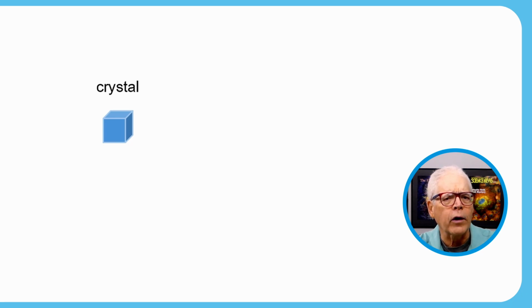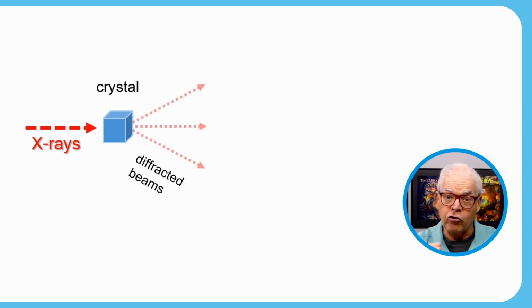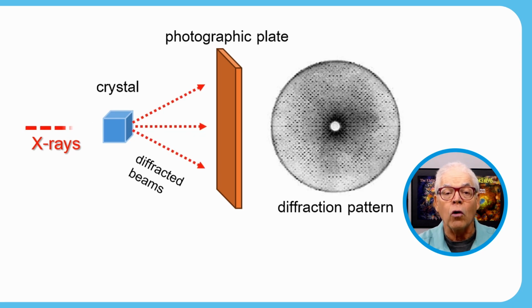To perform X-ray crystallography, a beam of X-rays is sent through a crystal, and it diffracts into many different directions. By measuring the angles and intensity of these diffracted beams, a crystallographer can produce a 3-dimensional picture of the density of electrons within the crystal and determine the positions of the atoms in the crystal.